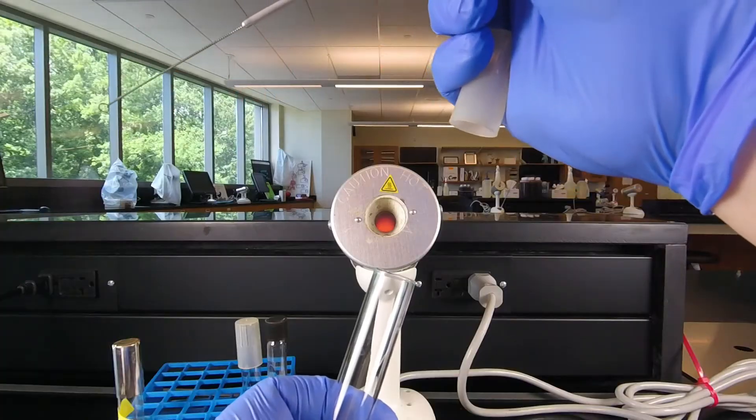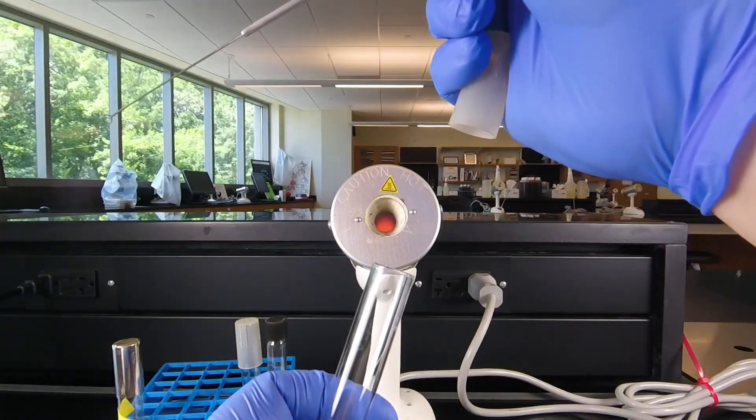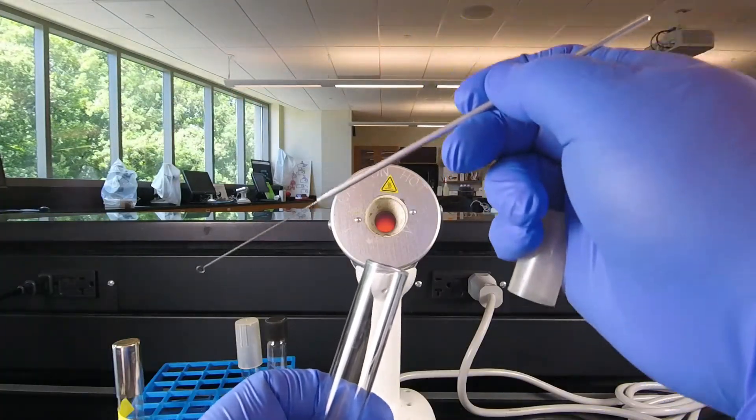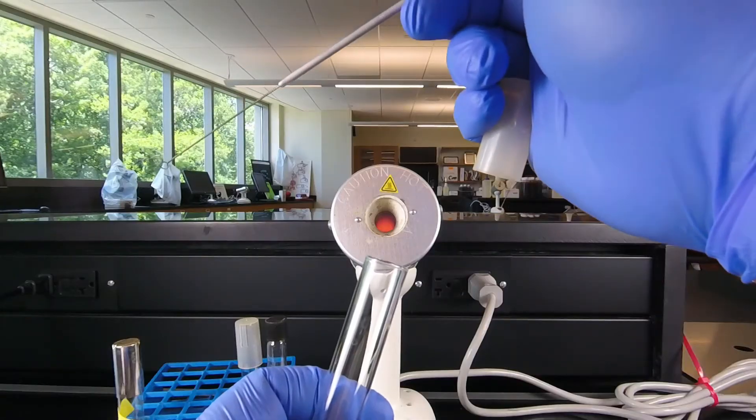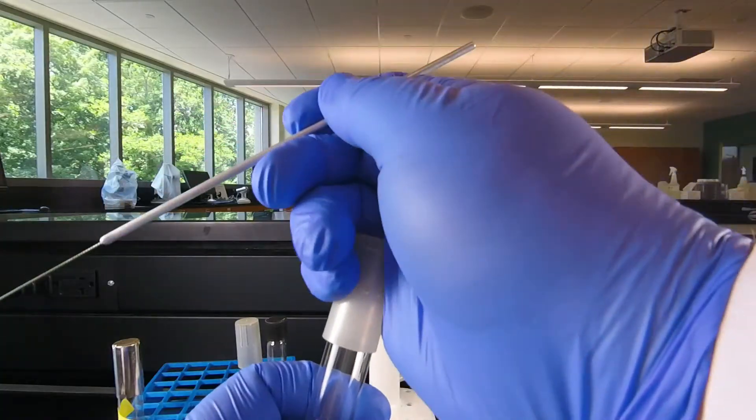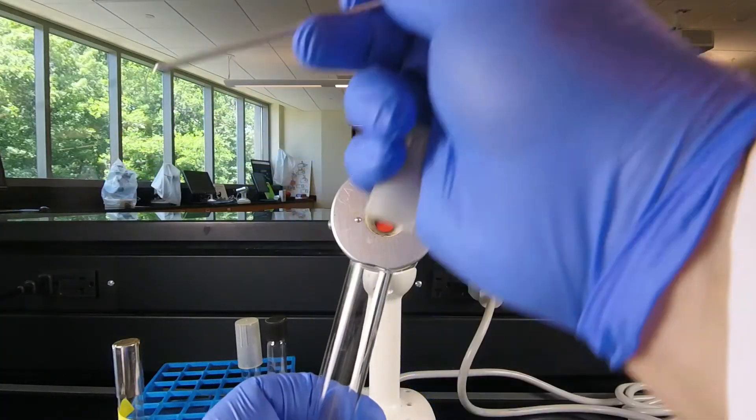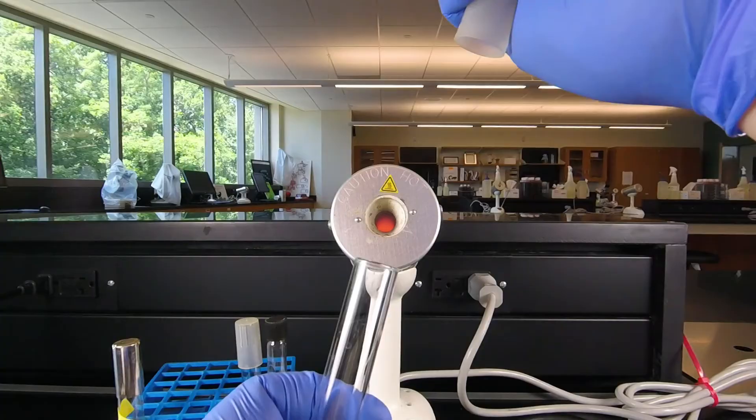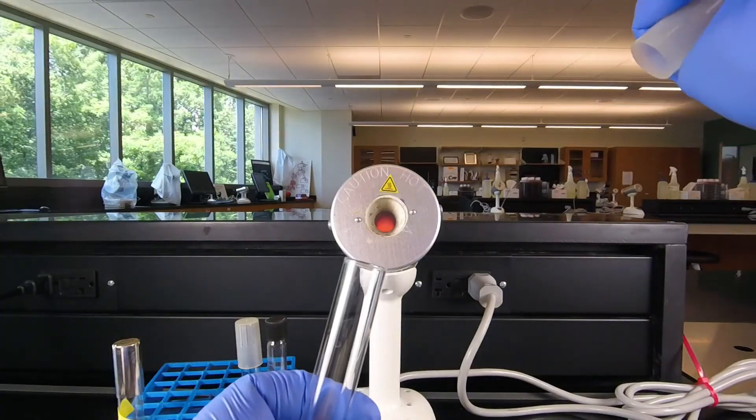Now this keeps the cap facing downward so airborne microbes can't fall in. We never set the cap down because that can contaminate it and leave the tube exposed for a longer period of time. So we simply grab the cap with the little finger of the loop hand, pull it off and it's out of the way and we can easily put our loop in.